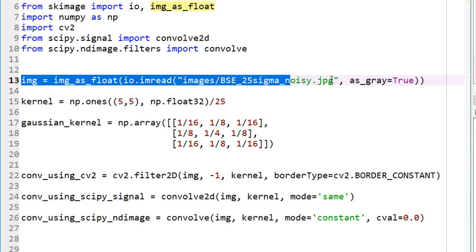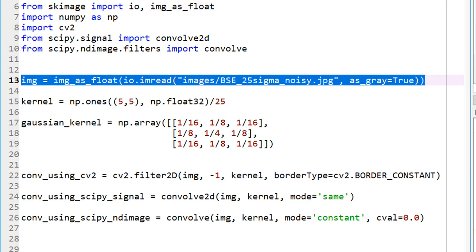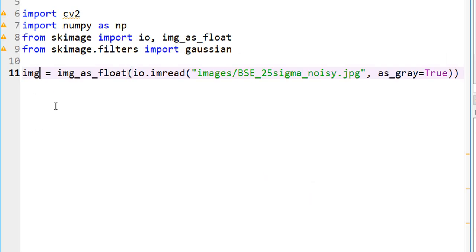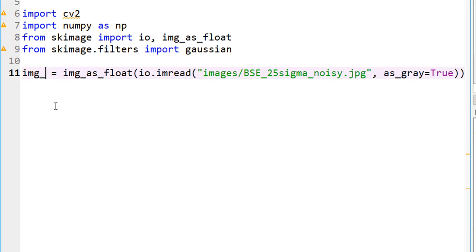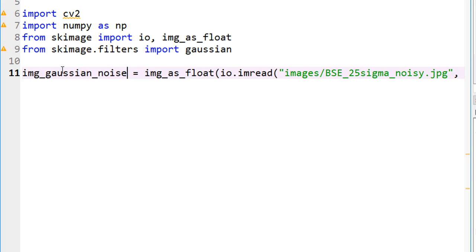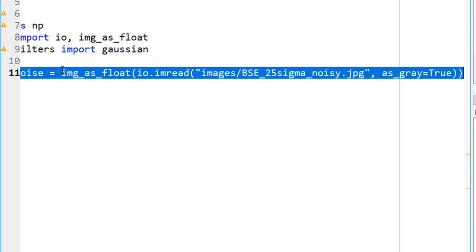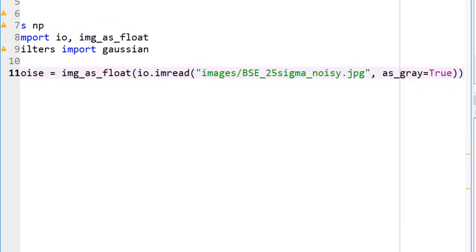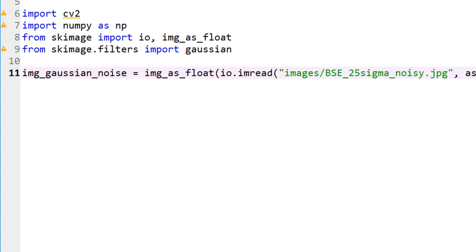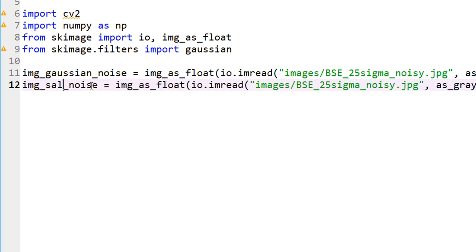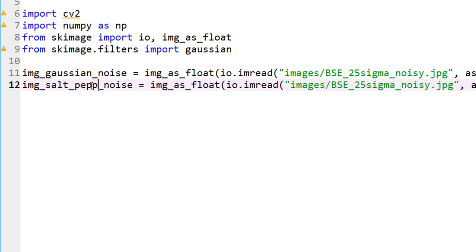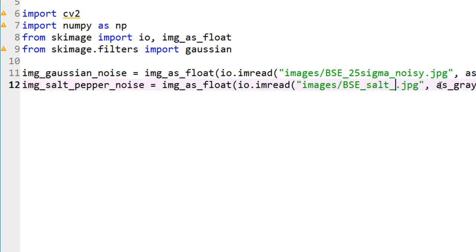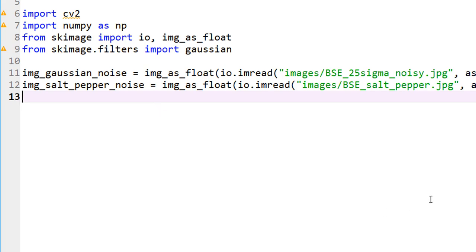Let's go ahead and read our image. It makes sense to define two different images. I have one image with Gaussian noise and another image with some salt and pepper noise. Let me create some more room here. This is salt-pepper noise, this image I called salt-pepper.jpg. All I'm doing is just importing the images. Just to sanity check, let me go ahead and run it to make sure the images are imported correctly. It looks like everything is fine.